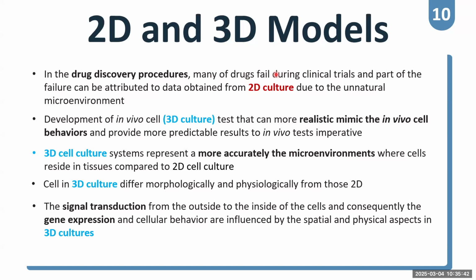So the 3D cell culture model becomes a good model to test drug response for the doctor. And this is what we call personalized medicine.